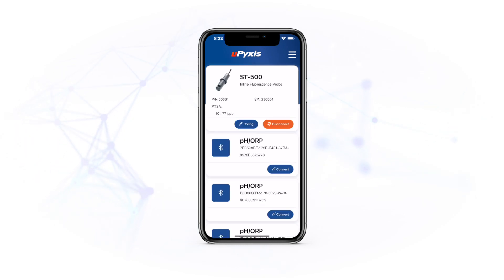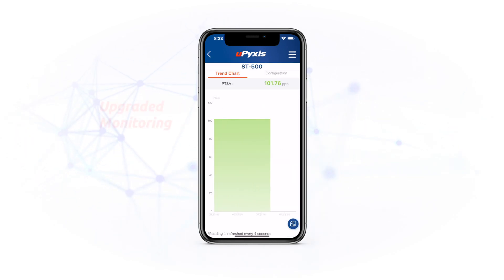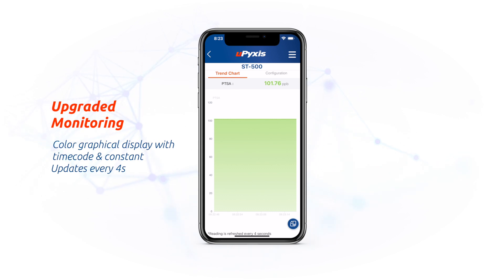To start, the UI got a massive upgrade. It allows you to quickly connect to your sensor and now offers a live color display for your monitoring capabilities, with a timecode and updates every four seconds.